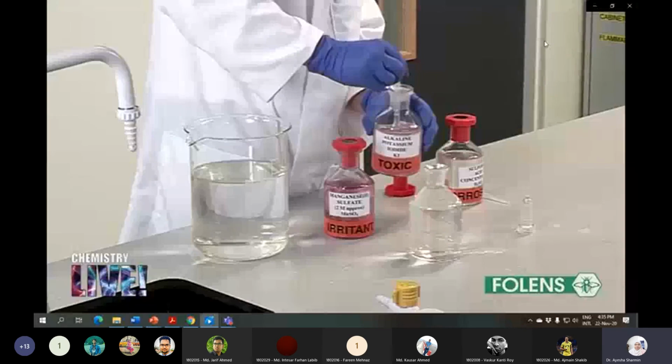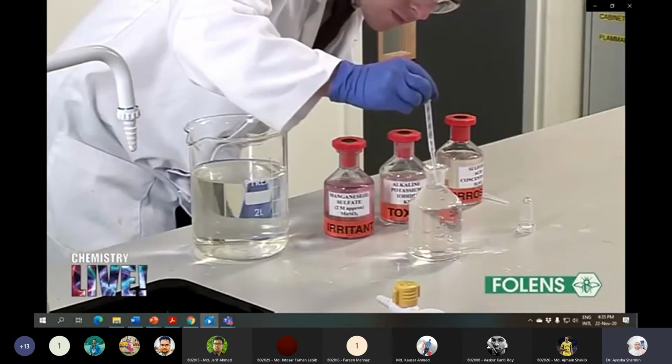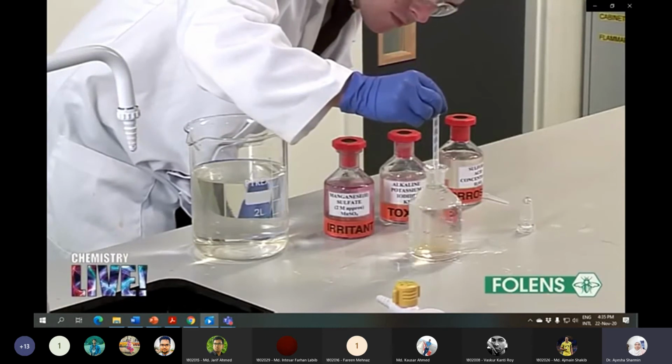Now they are going to add the alkaline potassium iodide. So sodium hydroxide and potassium iodide are in the same bottle.